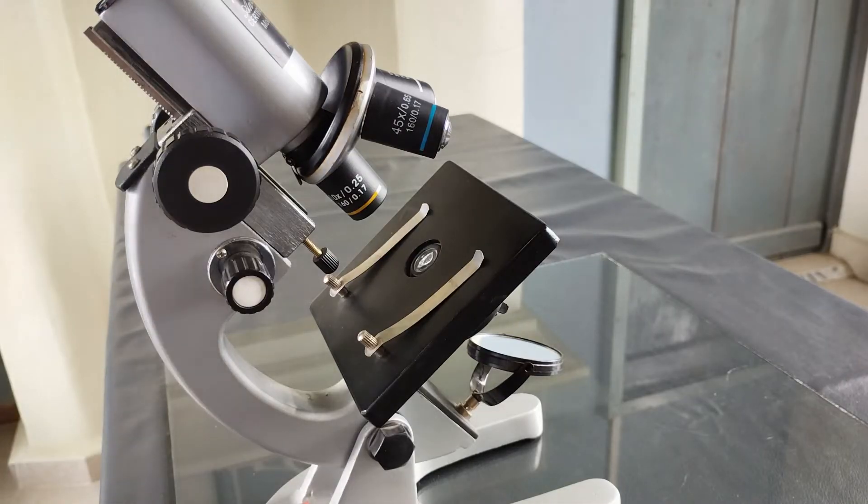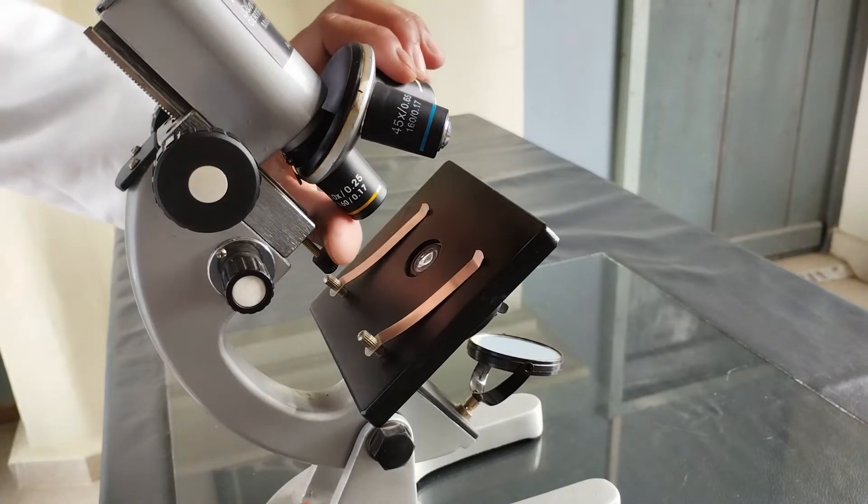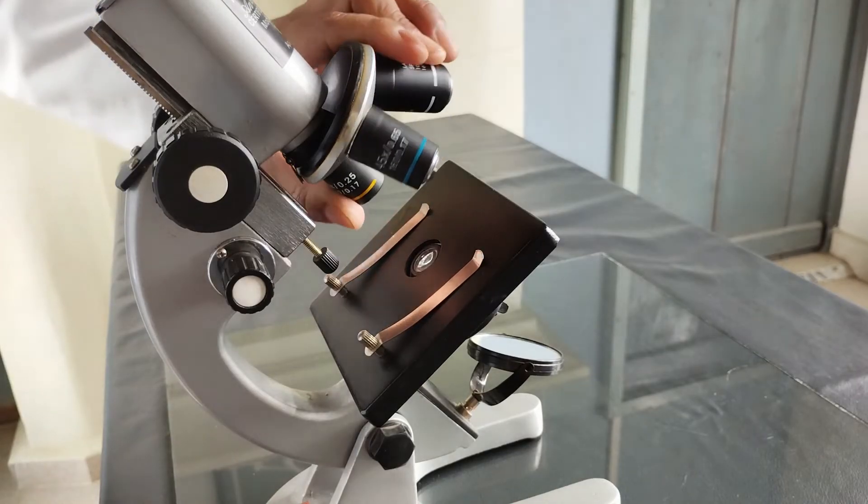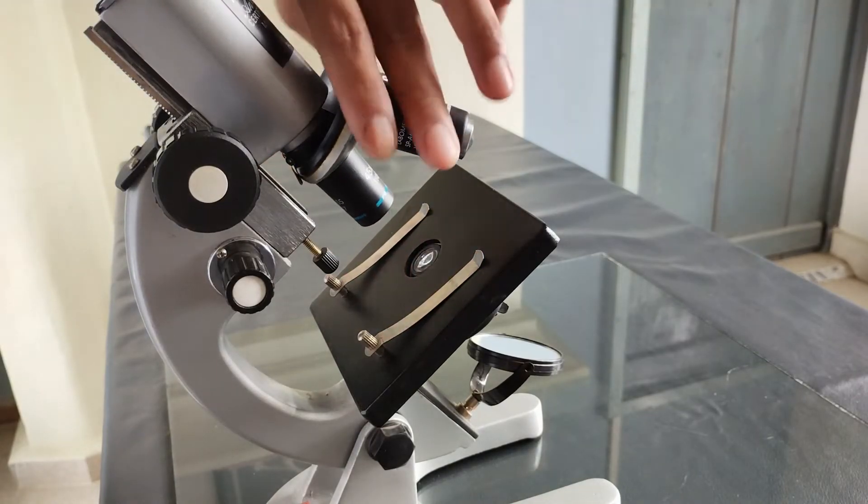Now, position a low-power objective lens, either the 4x or the 10x lens, in line with the eyepiece. To do this, rotate the nose piece until one of the low-power objective lenses clicks into position and aligns itself with the body tube.